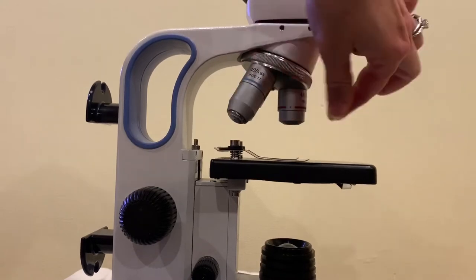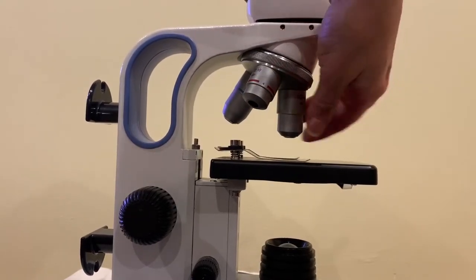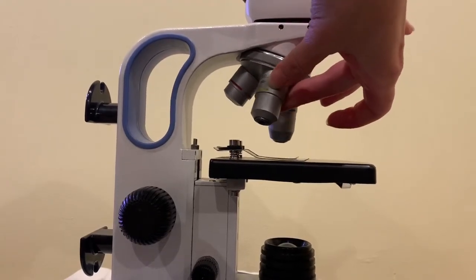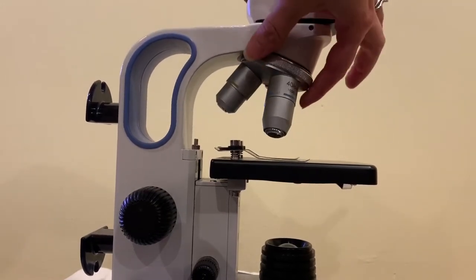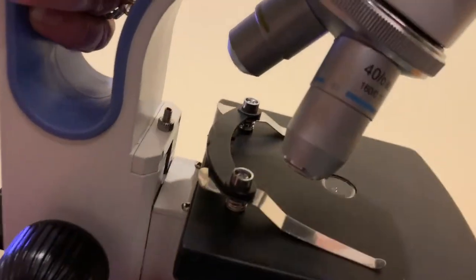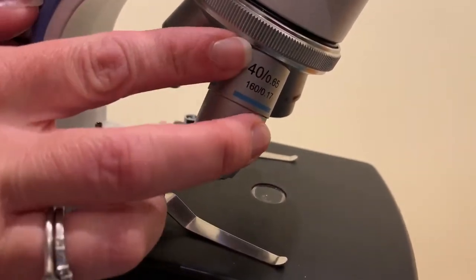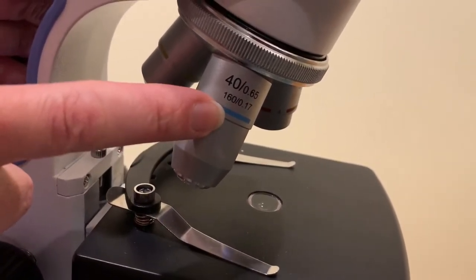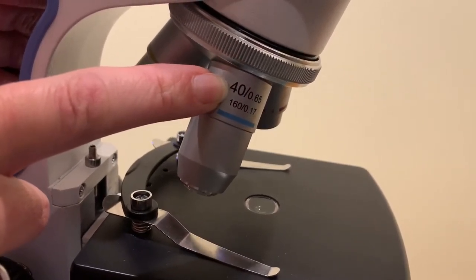Each one of these things sticking down here, each one of these is called an objective lens. And each objective lens has a different magnification written on it. So the largest has the number 40 written on it. So that means if we were just to look through this lens it would make an object appear 40 times larger than it would with the naked eye.